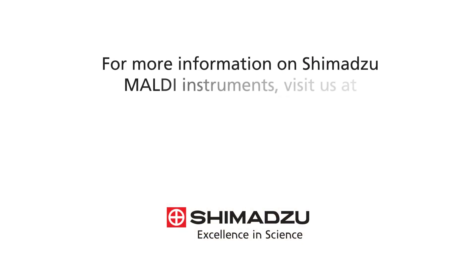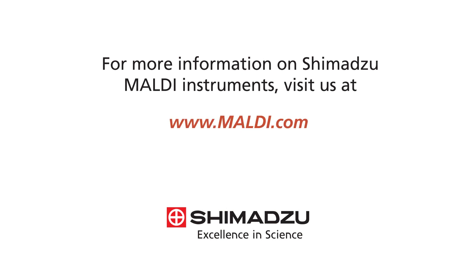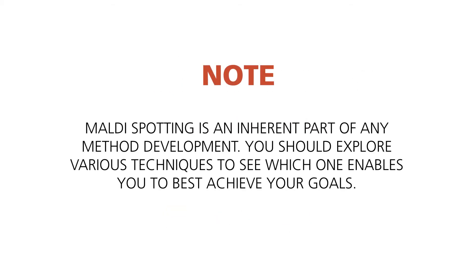For more information on Shimatsu MALDI Instruments, visit us at www.maldi.com.